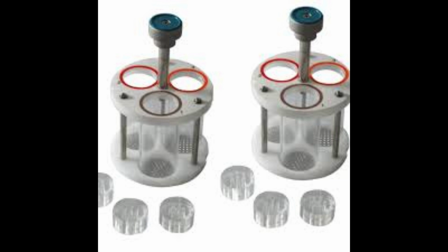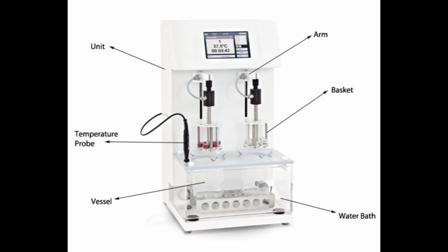1. Immersion and agitation. Cylindrical glass tubes, 20 to 22 mm, hold individual units, suspended in a 1-liter test fluid, usually water or buffer, at 37 plus or minus 2 degrees Celsius. A wire mesh, aperture 1.8 to 2.2 mm, lines the bottom plate. The rack reciprocates at 28 to 32 cycles per minute over a 50 to 60 mm stroke, repeatedly submerging and withdrawing the tablets.